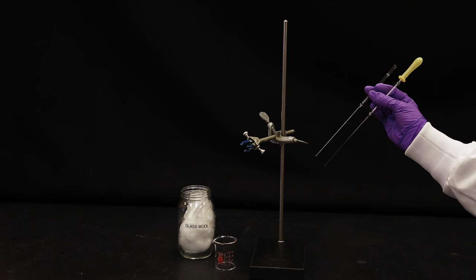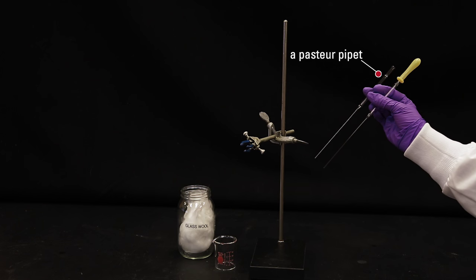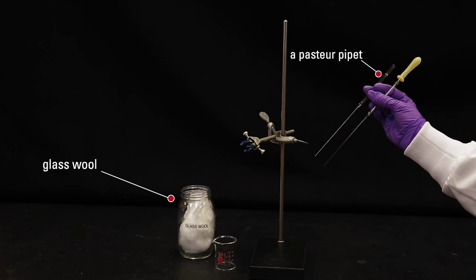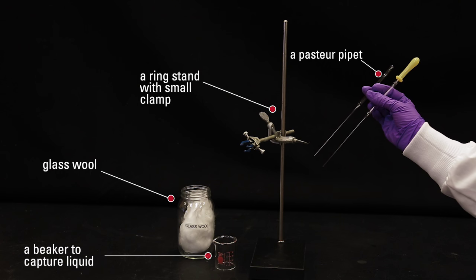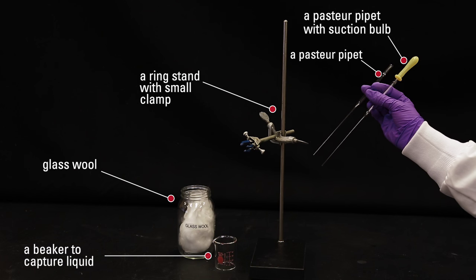To do this, you need a Pasteur pipette, glass wool, a ring stand with a small clamp to hold the Pasteur pipette in place, a beaker to capture liquid from the filtration pipette, and a second pipette with a bulb for suctioning.